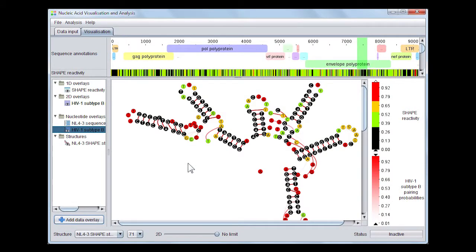That's it for this video. I hope it's given you some understanding of how NAVA works and how it can give you biological insights into nucleic acid secondary structures you might be interested in.